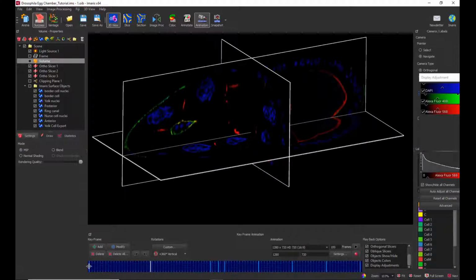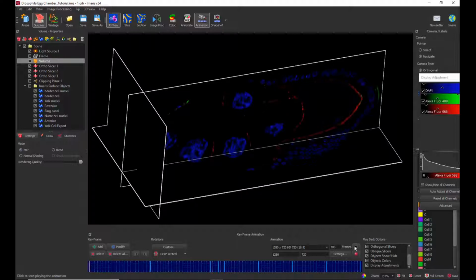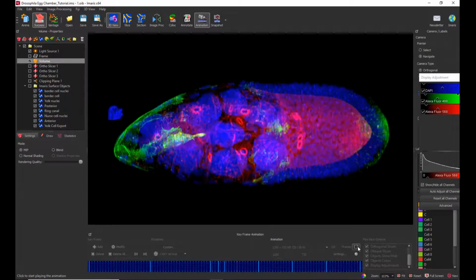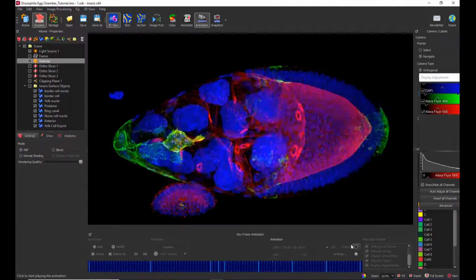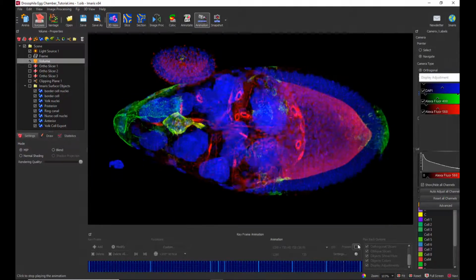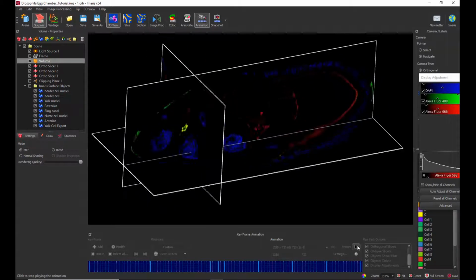Right, so now let's play the preview. So press the play button here. Okay, so it looks like the movie I've created. I just wanted to show you, to recreate this with you, so you can repeat it on your own data.